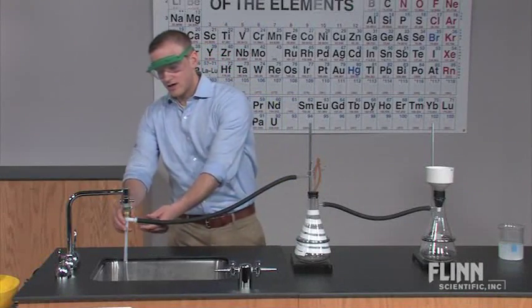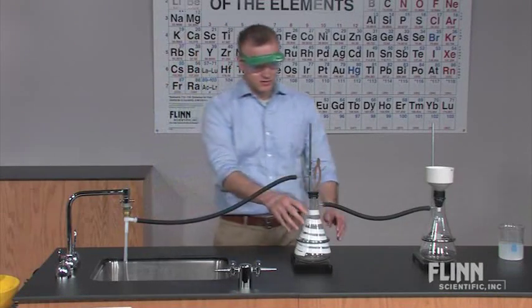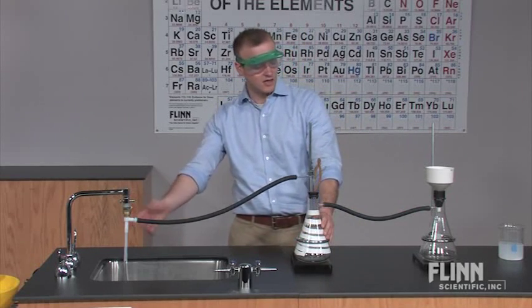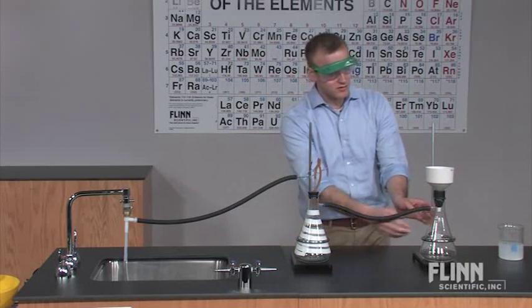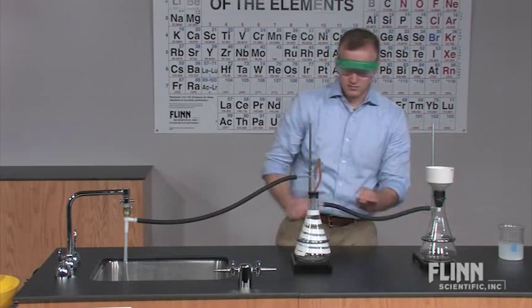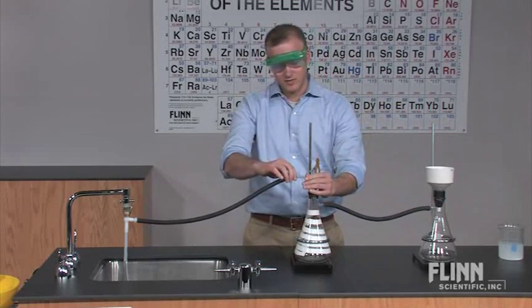At this point, you can connect the aspirator to your trap to prevent any liquid from being sucked back into the line. Connect the trap with another tube to the vacuum flask. Make sure everything is tight so that the vacuum is as strong as possible.